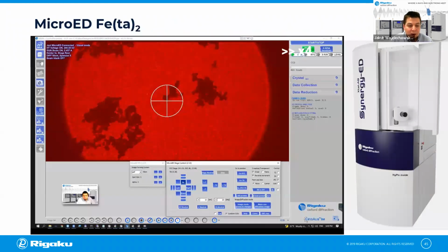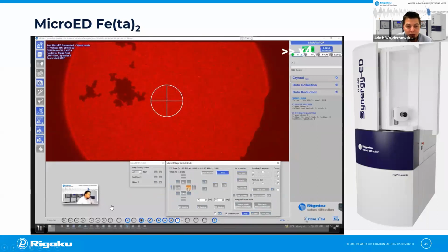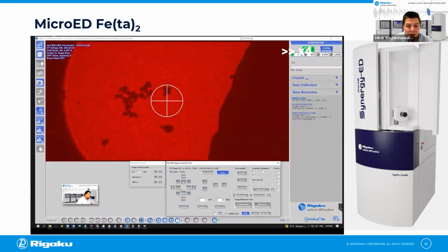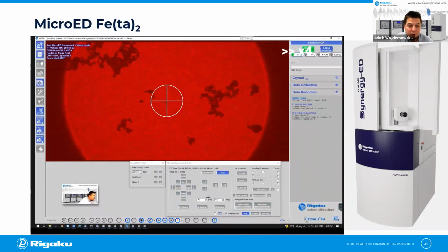And so I just packed the powder and sent it to Japan, which is actually where our demo unit is now sitting, and asked Ito-san, thank you again, Ito-san, for some remote access. He loaded the sample for me, and I recorded myself for Batie, showing how I cheat again and not learning how to solve the structure from powder.